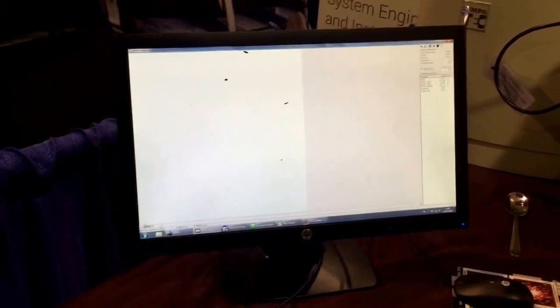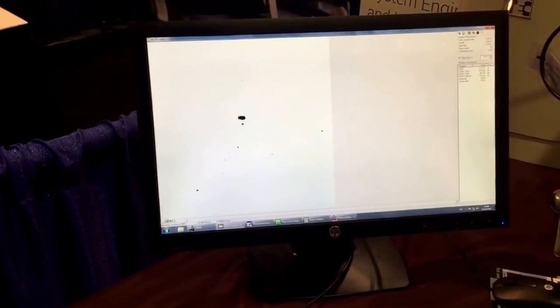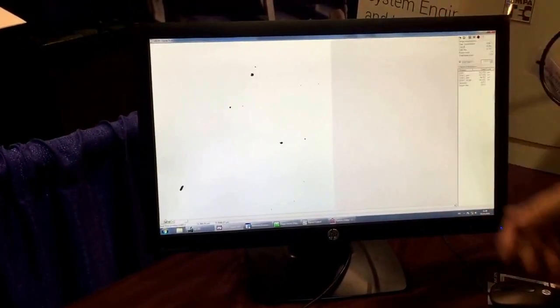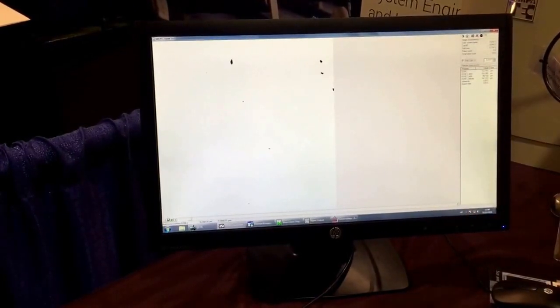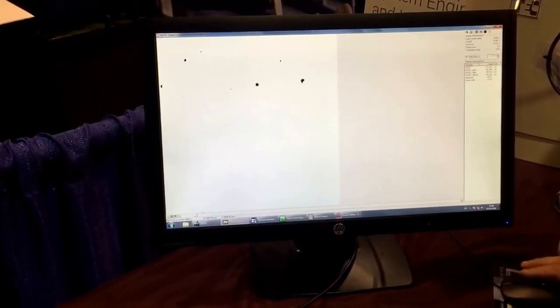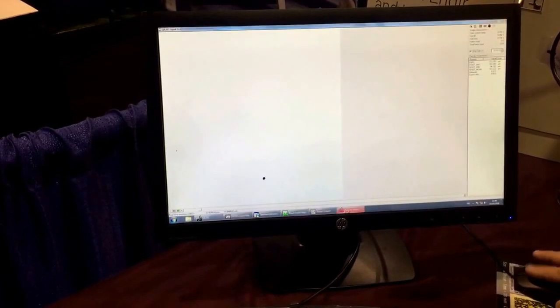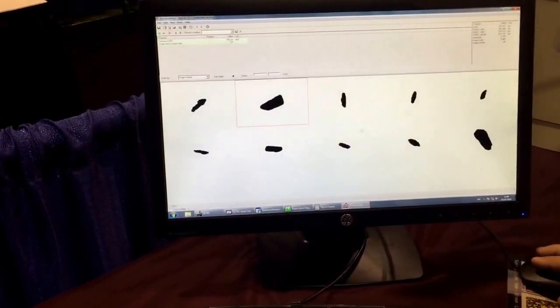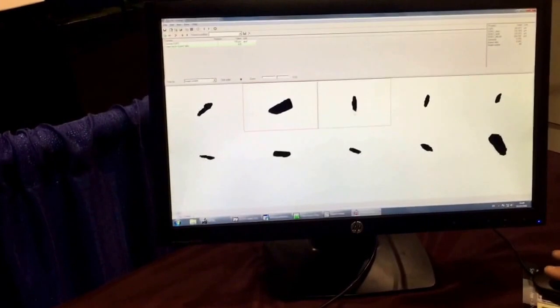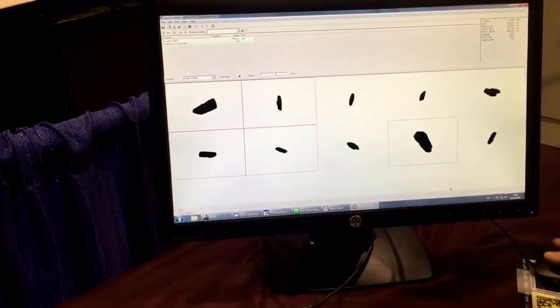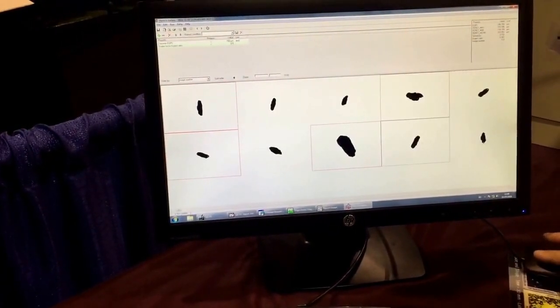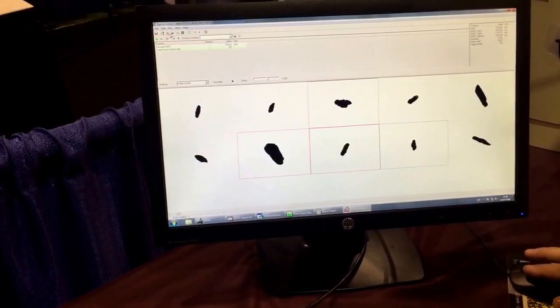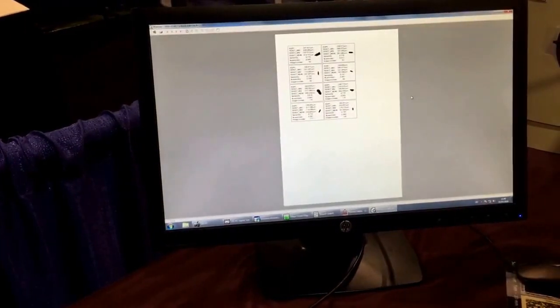And this is the video of the analysis. And sometimes folks say, well we don't have particles like that. And you say, oh yes you do. No we don't. Yes we do. And so you can come in here and, you know, maybe these are the guys that nobody believes you have. And then if you wanted to, you could send them a little report of those particles showing you, there they are, what's actually in there.